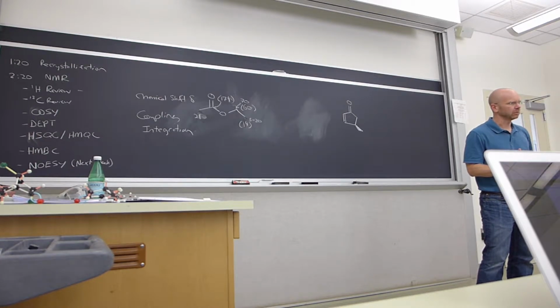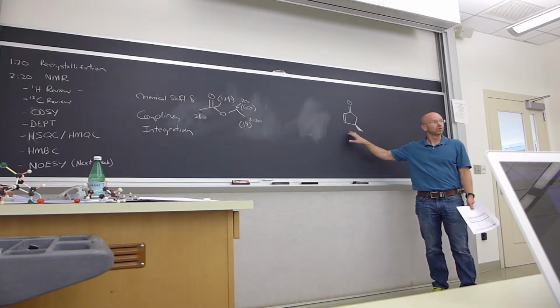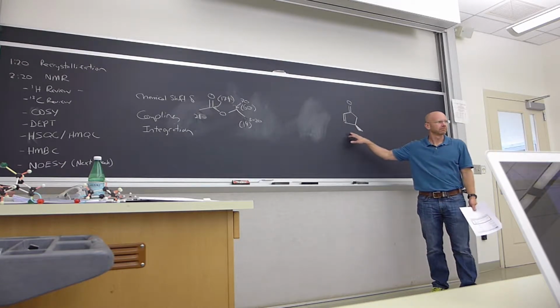All right, is everyone comfortable with these ideas? Let's try a slightly more complicated example. Do all of those things to that one.